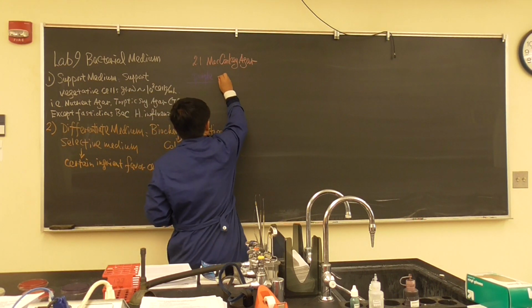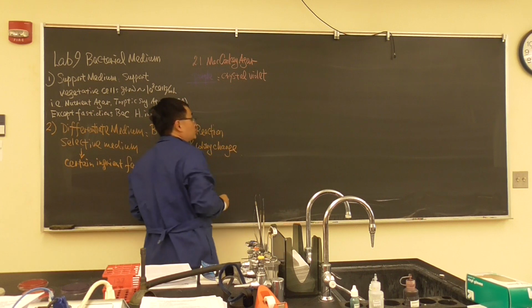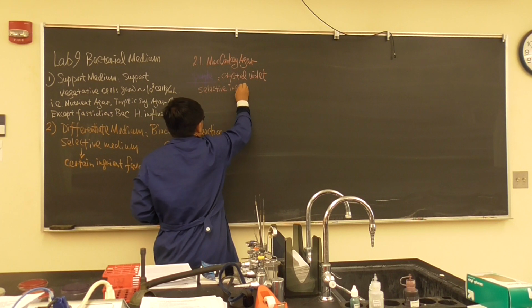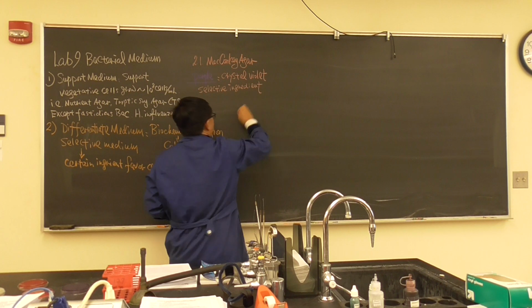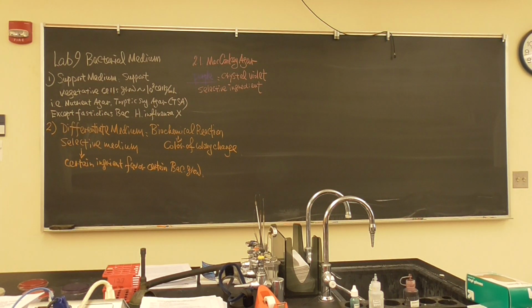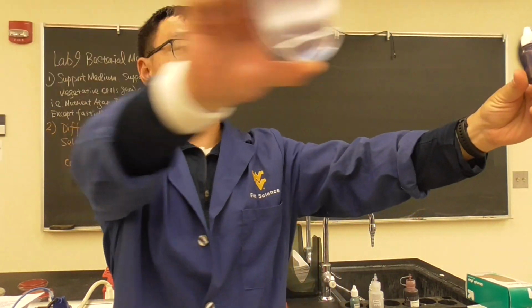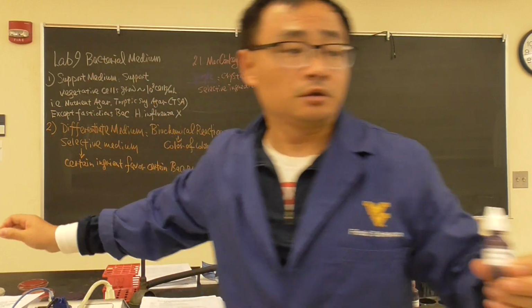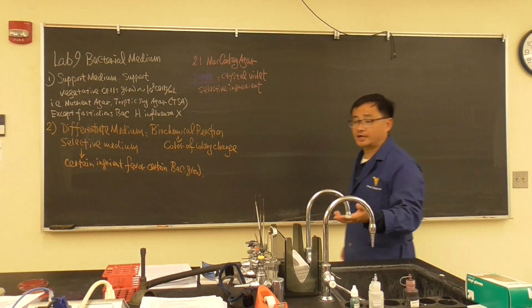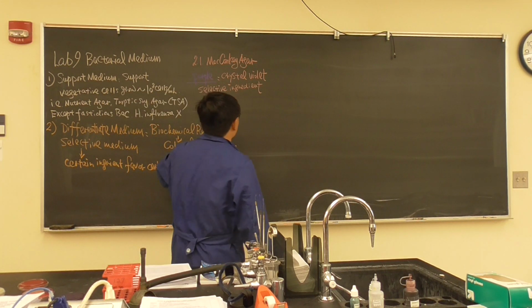Why? They have crystal violet. And this is crystal violet, a selective ingredient. Why? Crystal violet, when you do gram stain, you see it right here. Same color, because we added it. And the crystal violet will be attacking the peptidoglycan of gram-positive bacteria. So once you do a staining, which means it's dead, it's a selective agent.